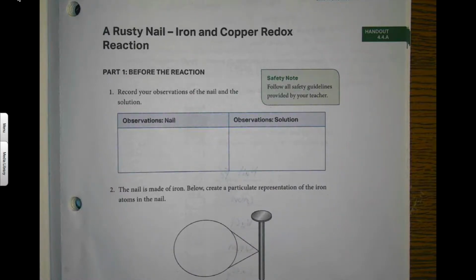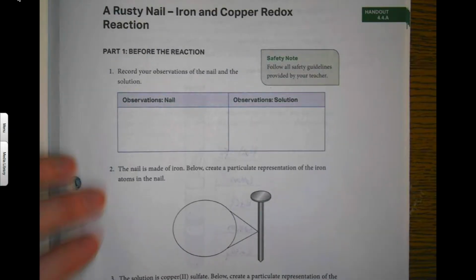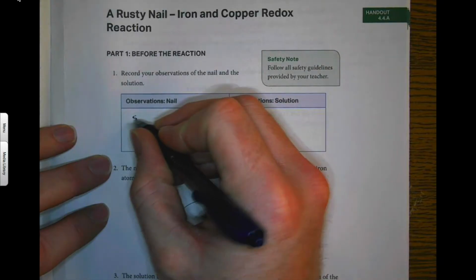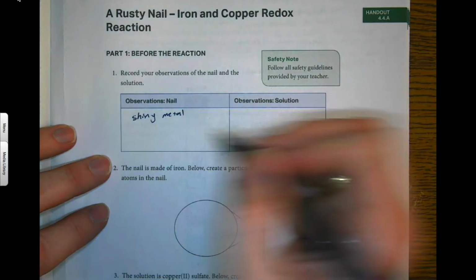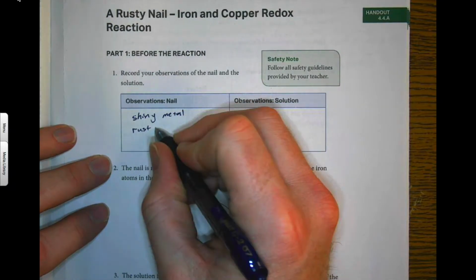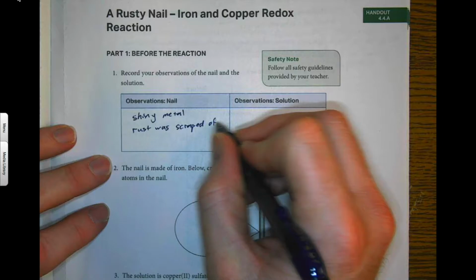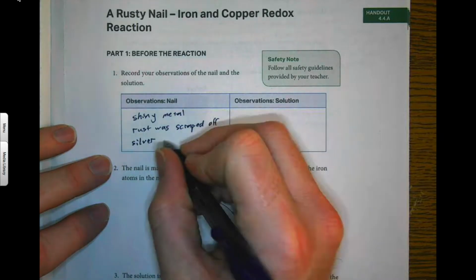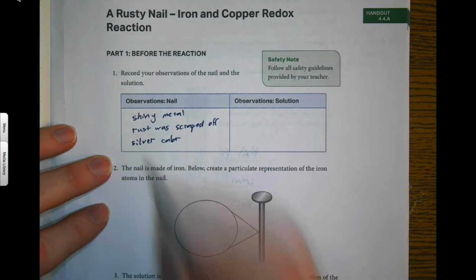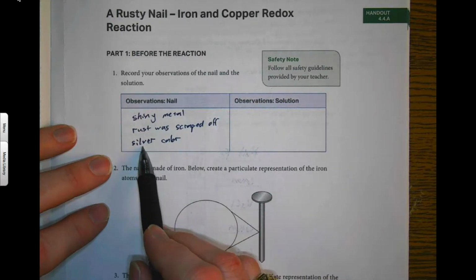Okay, so in handout 4.4a, in your workbooks, we can take a look at just a few things. So our observations of the nail. Hopefully you saw that it was a shiny metal, and say the rust was scraped off. Let's say that it was a silver color. Now, if I just said it was silver, then silver is an element. So that's not specific enough. Let's say we could call it a silver color.